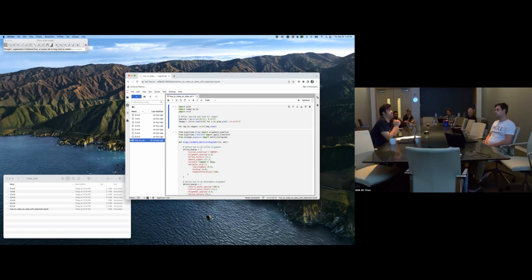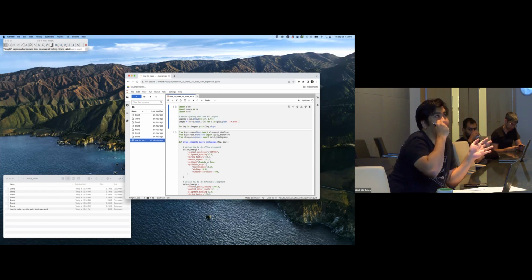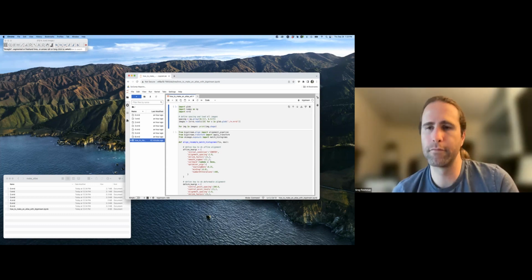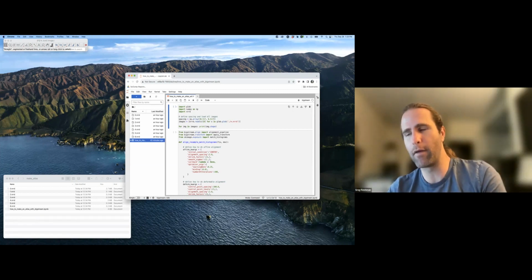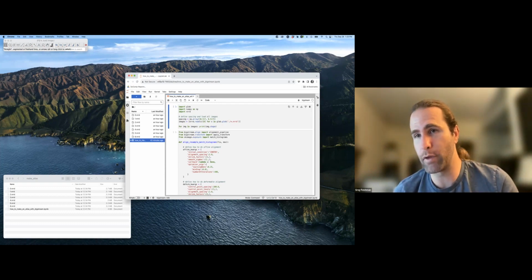I think you mostly answered my question. Maybe just in a normalization case, for example, you were stretching from 0 to 1,000 to 0 to 65,000, right? If you just do multiplication to do that shift, I would expect intensity values every 65 values, right? Mm-hmm. And you don't have that much data, right? Your data is not actually available at that resolution. I think that what happens in that case is a lot of interpolating.